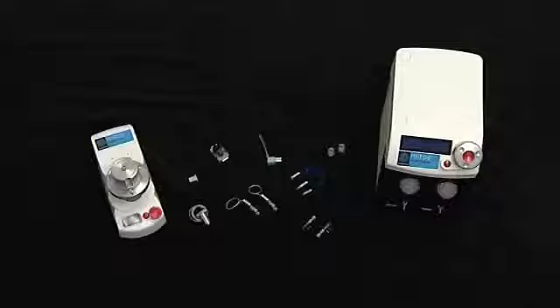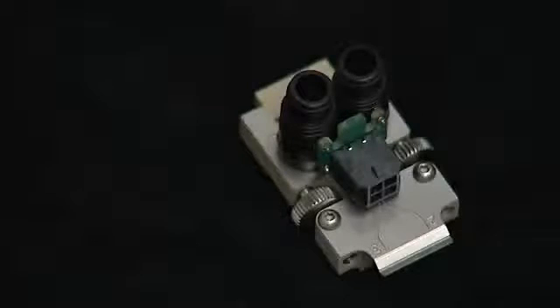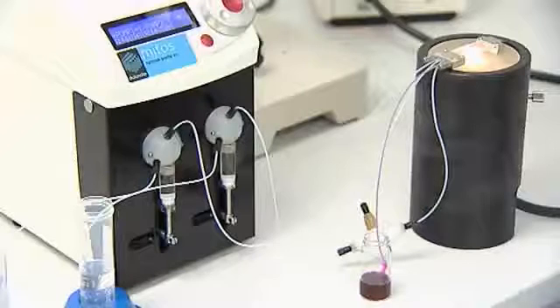Where a longer reaction time is needed, the chip will have longer channels and reactions can be controlled for hours. Dolomite offers a range of pumps to allow you to select the optimum technology.